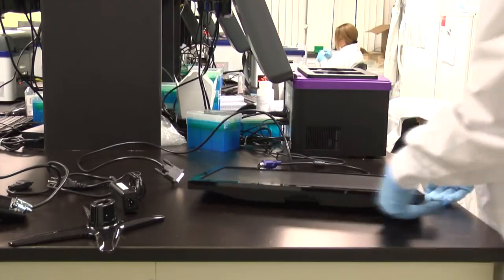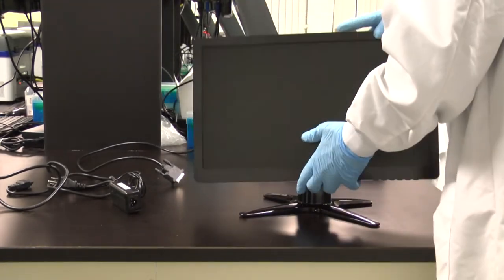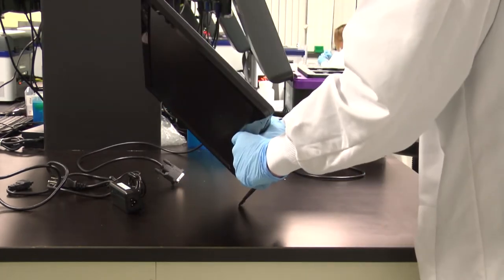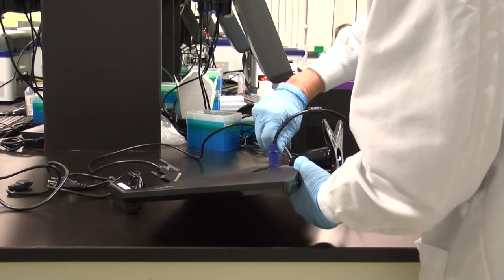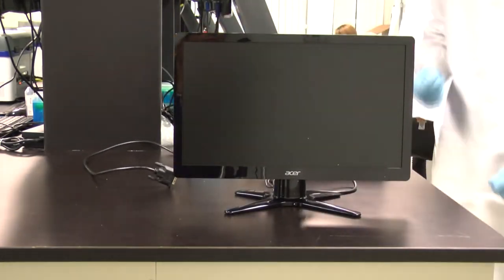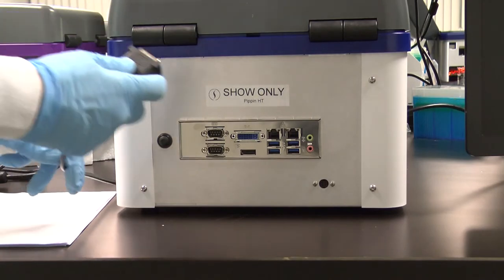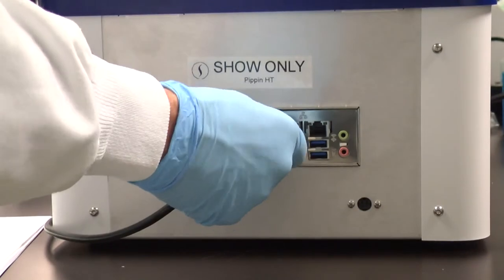Assemble the computer monitor according to the manufacturer's instructions. Using the video cable, attach the Pippin HT to the monitor with the DVI port on the back panel.